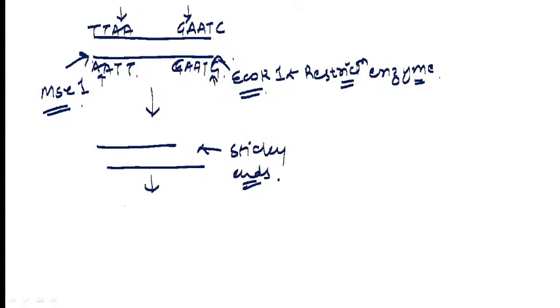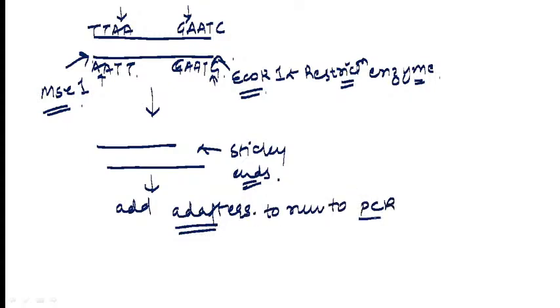Now we add adapters to it, to run the PCR reaction. These adapters are going to be complementary to our EcoRI or MseI site.